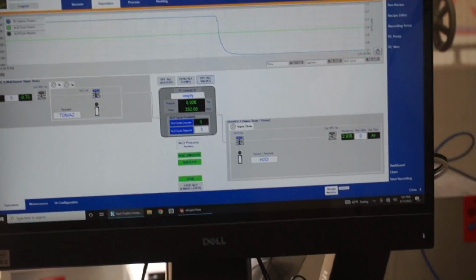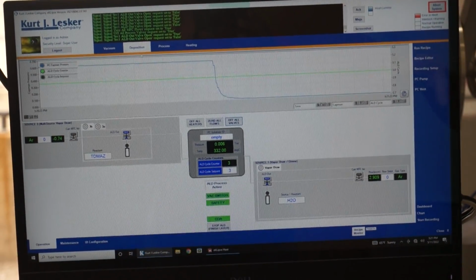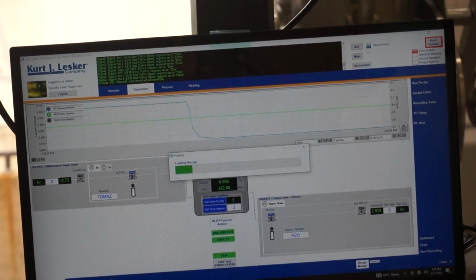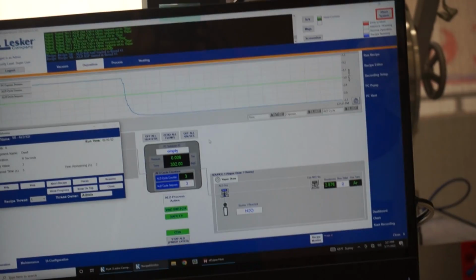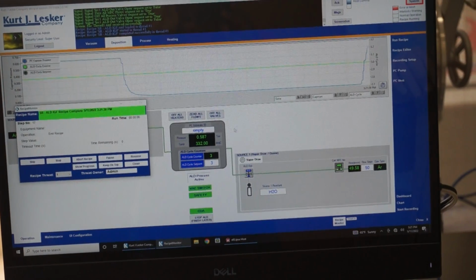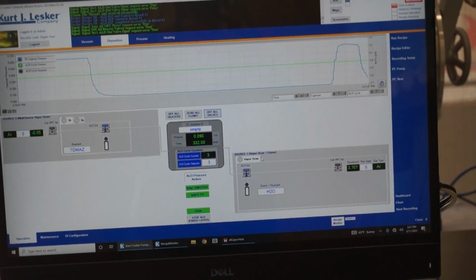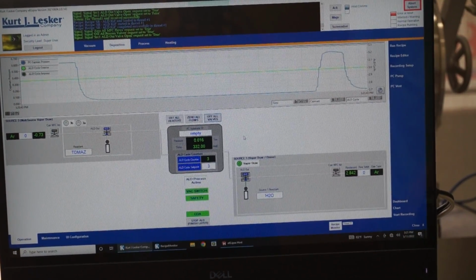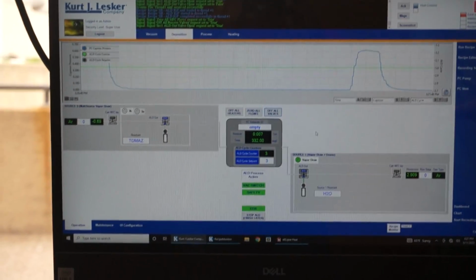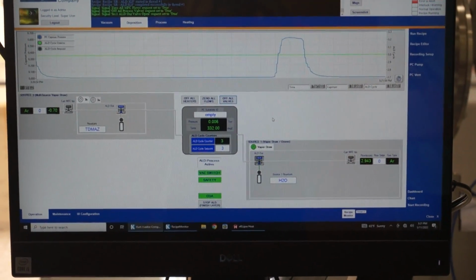So this is part of the pump purge. You do 3 open, close, open, close, open, close with gas flow. And then you do 3 where you get the ALD inert gas flow. This will bring us back up to 600 and some millitorr pressure. You do this part 3 times: zero all flows, turn off all valves, open that valve, and let it return. So 3 times with flow, 3 times without flow. That's the pump purge procedure. Anytime you load or unload an ampule, you have to do that.